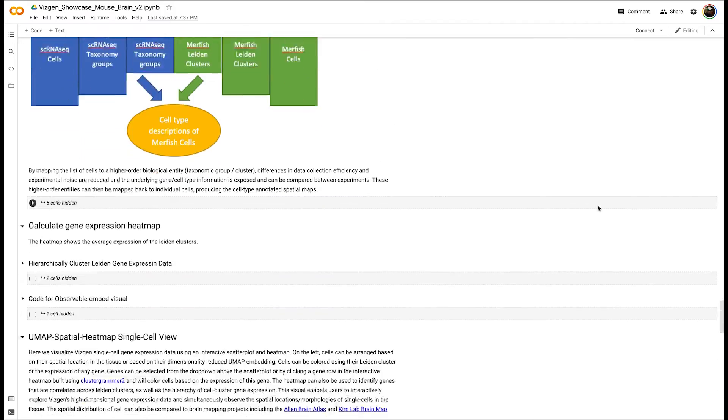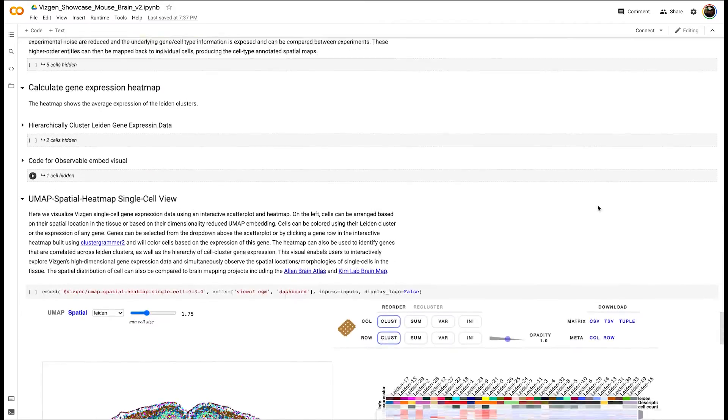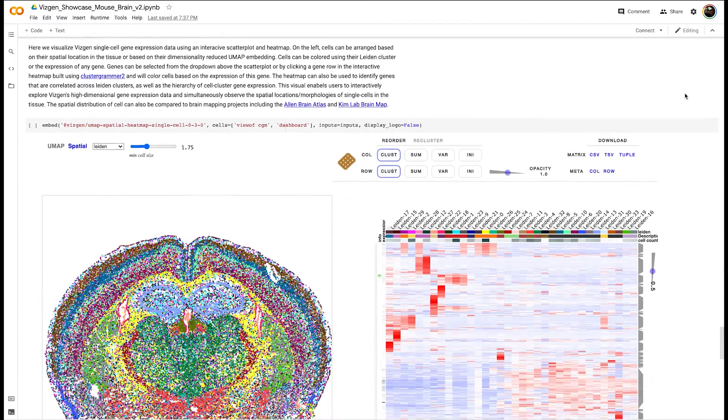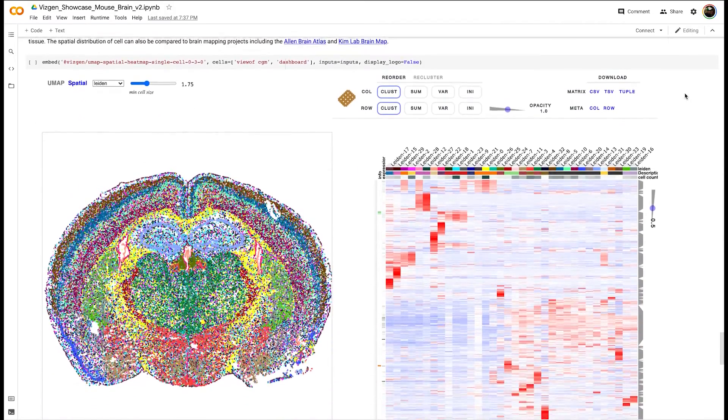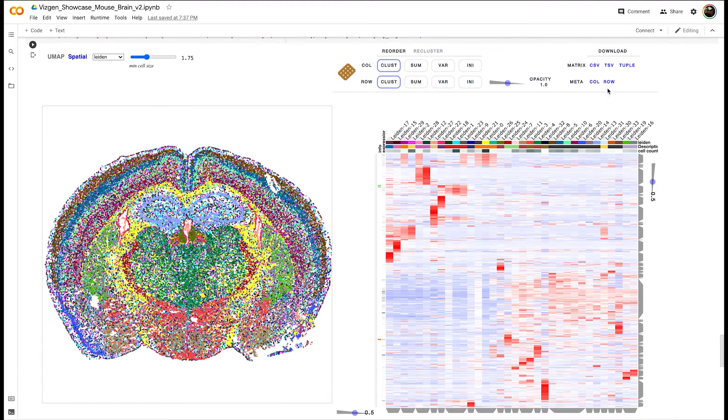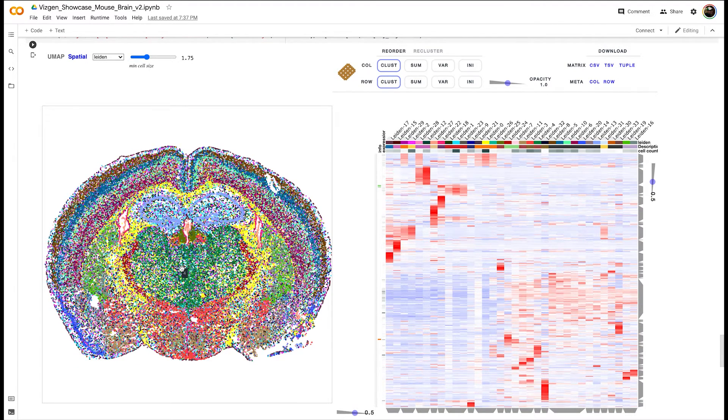When you scroll down, you see this interactive dashboard view that we built using DECGL on the left and the open-source interactive heatmap tool, ClusterGrammer 2, on the right.